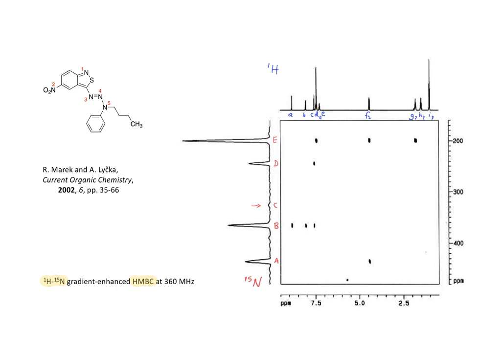However, we can make correlations of nitrogen with protons. For nitrogen A, there's a correlation with protons F2.